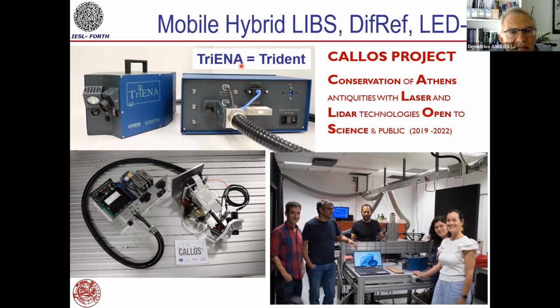We call it Triana in Greek, trident in English, if you like, in a single probe head and a control unit. So the techniques combined include LIBS, absorbance or diffuse reflectance, if you like, and fluorescence emitted following excitation with a LED source.